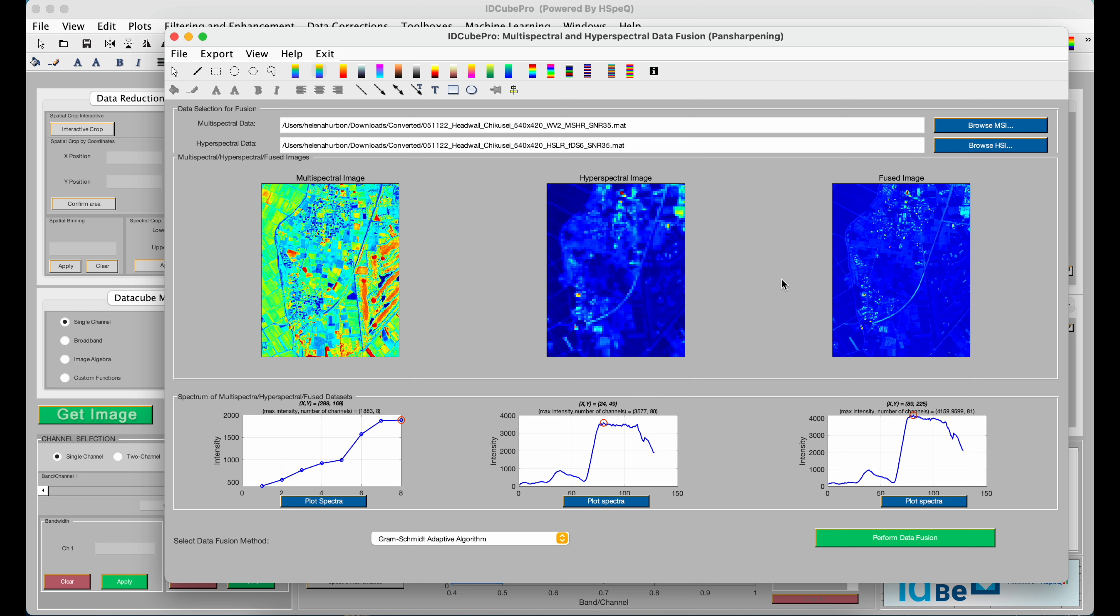If you're interested in saving the fused dataset, you'll right-click and click Save Fused DataCube.